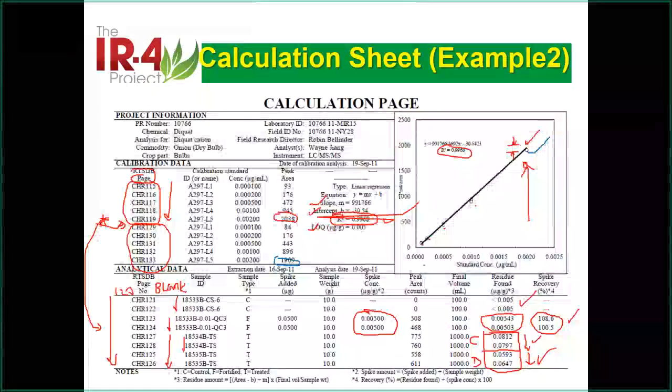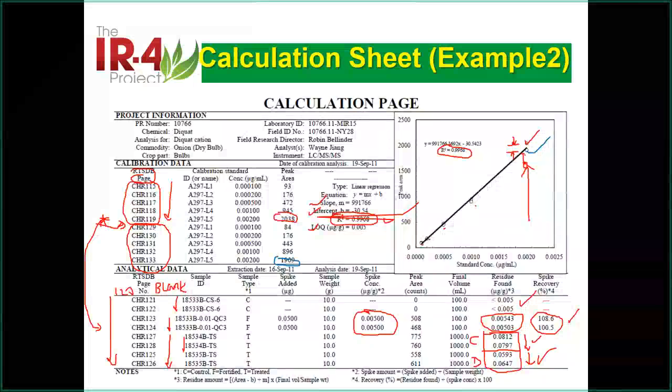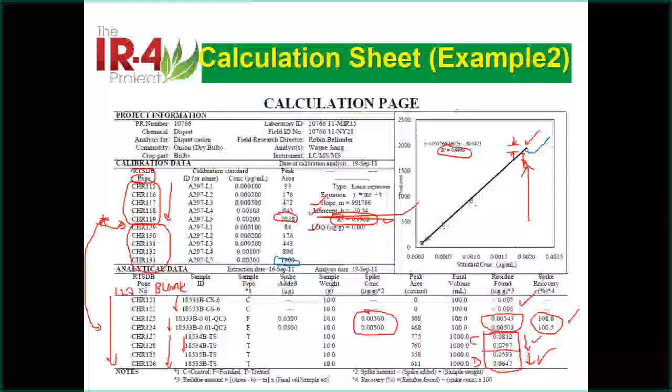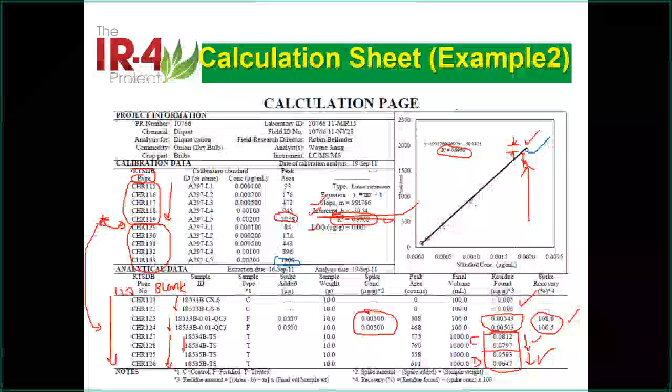That's because of how we calculate the R squared value: this is the curve in the middle, this is the distance to the curve, and you square that, then divide by the number minus 1. That's equivalent to a lot of calculations there, a standard deviation type.